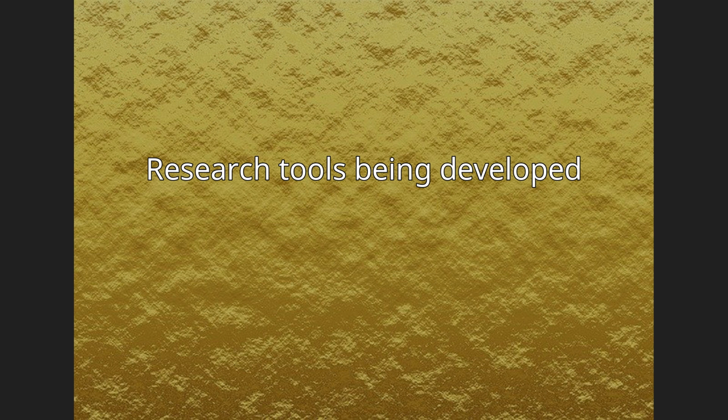One such effort describes the development of an in vitro model to study the tissue response phenomenon. Midbrains are surgically removed from day 14 Fischer 344 rats and grown in culture to create a confluent layer of neurons, microglia, and astrocytes. This confluent layer can be used to study the foreign body response by scrape injury or depositing electrode microwires on the monolayer, fixing the culture at defined time points after insertion/injury, and studying tissue response with histological methods.